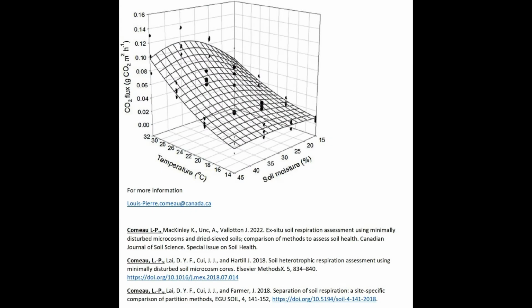This 5-minute presentation was a summary of the method, and many details could not be explained. All the details about the method were published in our main paper in 2018 in MethodsX, and other papers that compared the method with other standard procedures were also recently published.